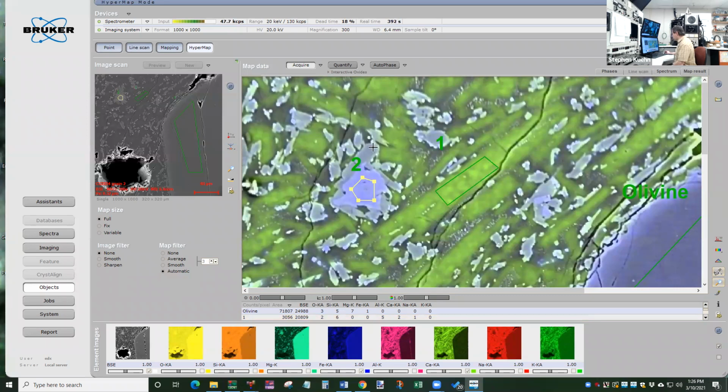And then I'm going to do this thing off to the side, which looks slightly different. Another little tiny crystal there. And that's probably most of what's here, although there's some stuff that's showing up gray because it's not any of the elements I've selected. Oh, and that little bar that's kind of going by is because the computer is still having the microprobe scan and collect more data. So it's just showing the progress of it. It's still scanning and scanning and scanning.